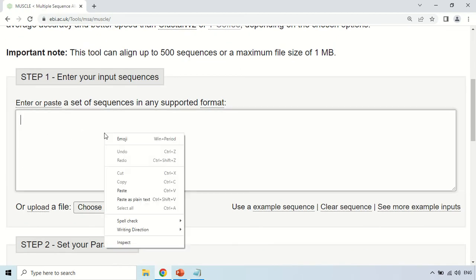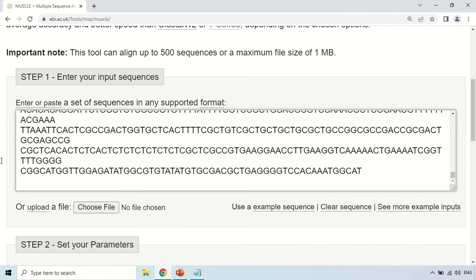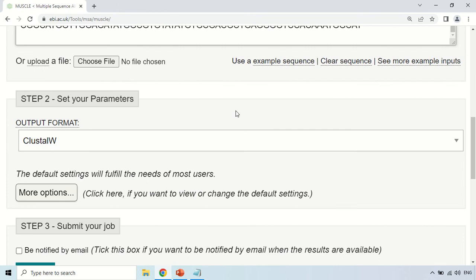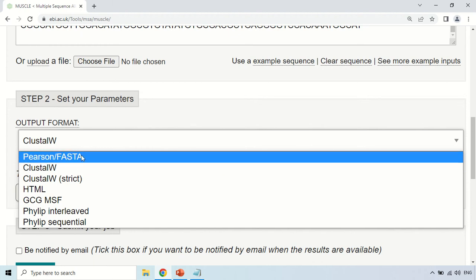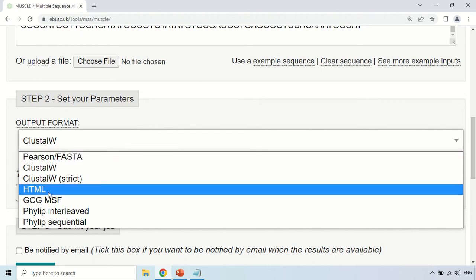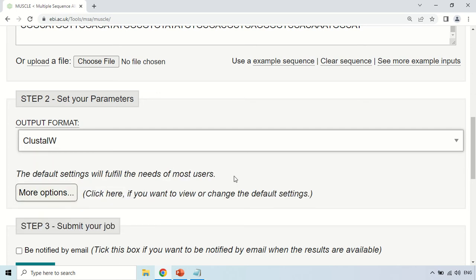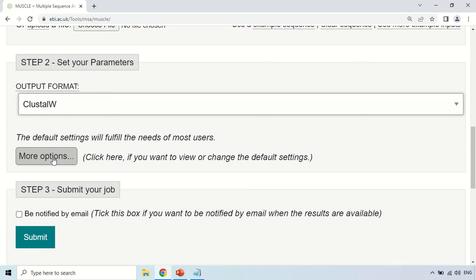Move back to the MUSCLE tool and just paste your sequences here. You can also upload a file — if you do not want to copy and paste, just choose your file containing the sequences under the 'Choose File' section. The second step is to set your parameters. Here you have to choose the output format. There are many formats like ClustalW, Pearson, FASTA, and HTML — it's up to you which format you want. For this instance, I am choosing ClustalW output format. Under 'More Options' there are more specific options used for research purposes, but the default options are sufficient most of the time.